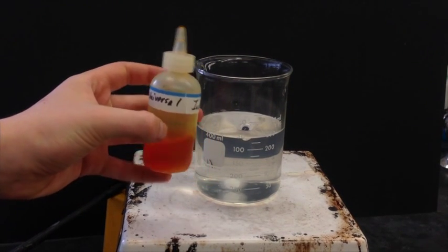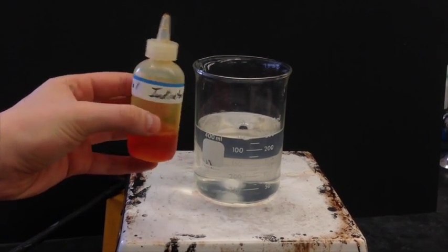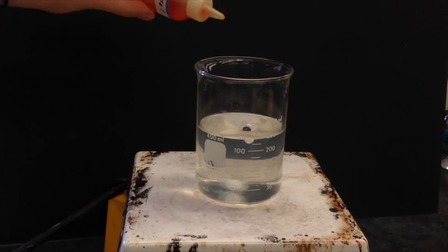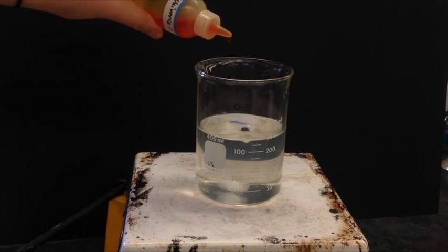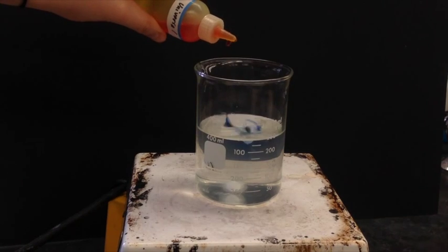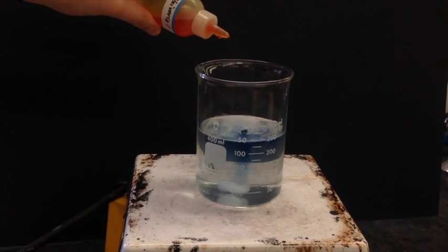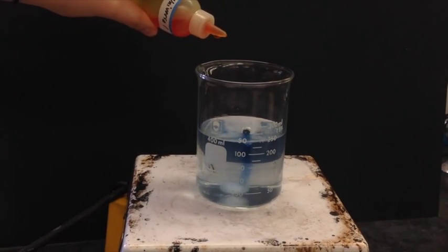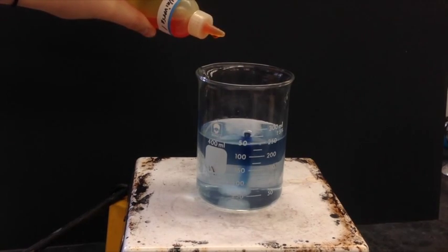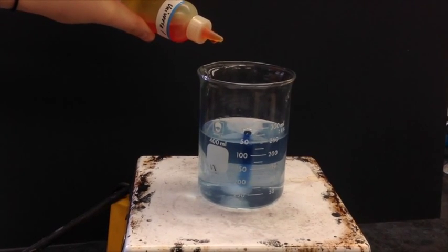In this demo, I'm going to add several drops of universal indicator to the casein solution to help us determine the effect of pH on protein solubility by adding HCl, an acid, and NaOH, a base. As we're adding the indicator, you can see that the solution is turning blue, so you know we're starting out with a basic solution.